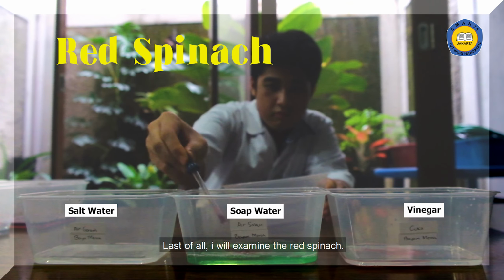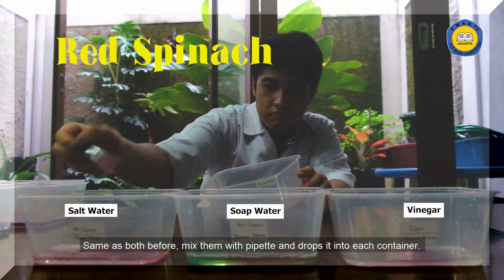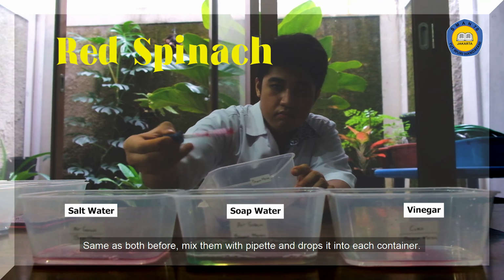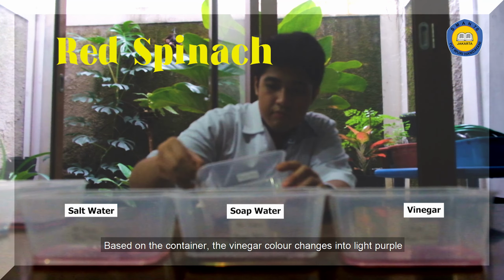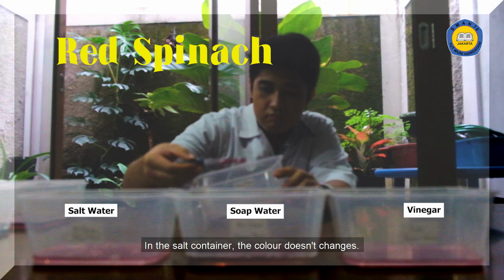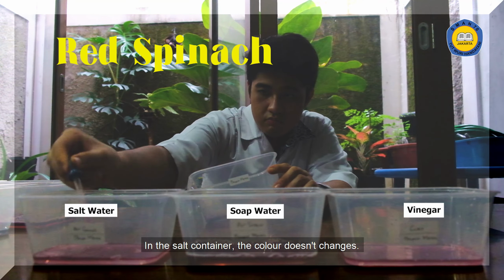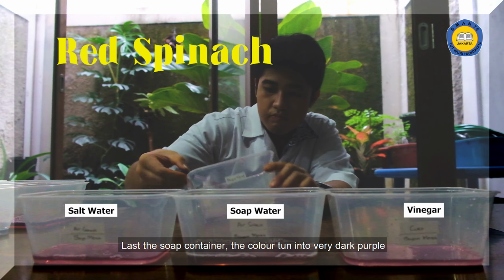Last of all, I will examine the red spinach. Same as both before, mix it with the pipette and drop it into each container. Based on the containers, the vinegar color changes into light purple. In the salt container, the color doesn't change. As for the soap container, the color turned into very dark purple.